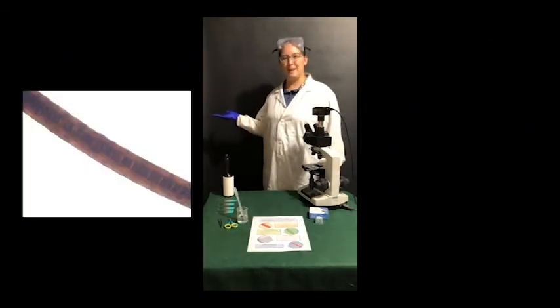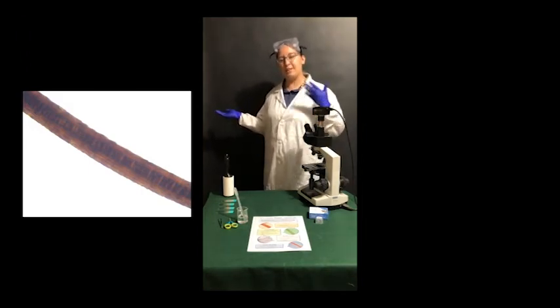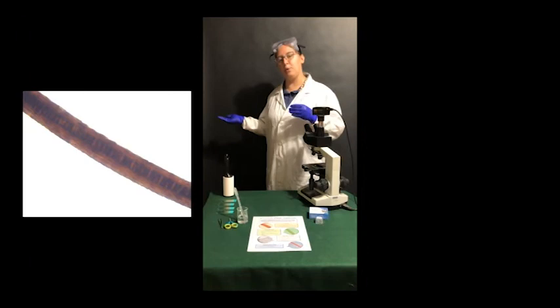Our second sample that you can see here—it's got little spiky pieces on it, it also has a darker color, and when you look at the middle where the cortex and the medulla are, you can see that it's most likely a dog hair.